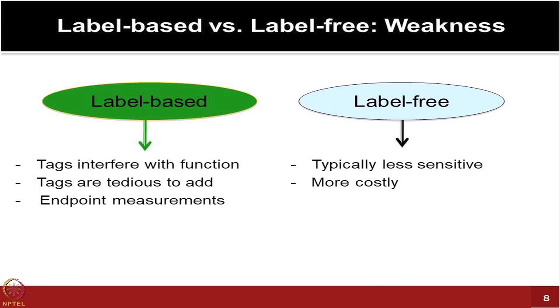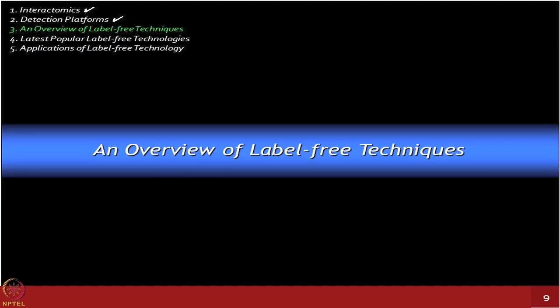They are sometimes more costly, and again you still have to ensure that all the signal which you measure is coming because of the actual binding and not because of the bulk effect, not because of something else which is happening and you are seeing an artifactual response. So many of the things are still in a more infancy, early developmental stage, which needs to be tested out well. Now just to give you a feel, we are covering 2 or 3 label free technologies in this course, but there are many which are actually under development.